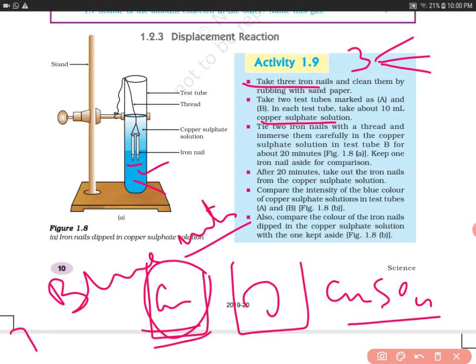Dip the iron nail into the copper sulfate solution. After 20 minutes, take out the iron nail from the copper sulfate solution.